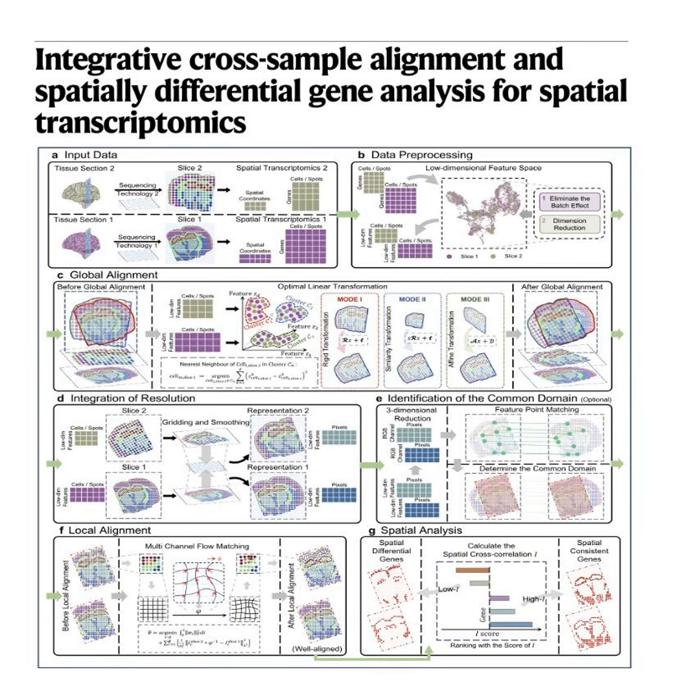Yes. Researchers compared a slice of a healthy artery to a slice of an atherosclerotic artery. And this perfectly highlights the flaw in older methods. When researchers use traditional differential gene expression analysis, specifically a common statistical tool called the Wilcoxon rank-sum test, they look at specific genes like CCL2 and ACE. And what did the old test show? Well, the Wilcoxon test basically just looks at overall volume, and it found almost zero statistically significant difference in the total expression volume of those genes between the healthy and diseased hearts. The overall counts were almost exactly the same.